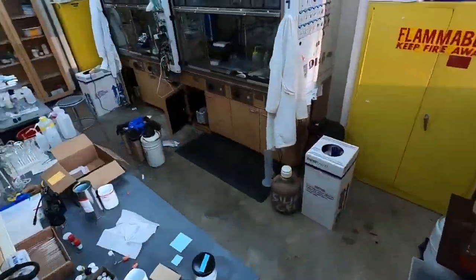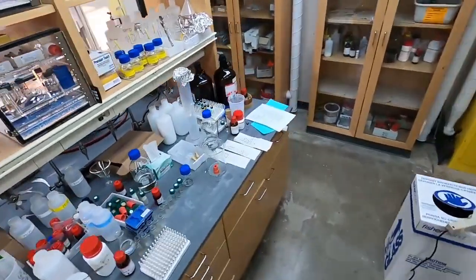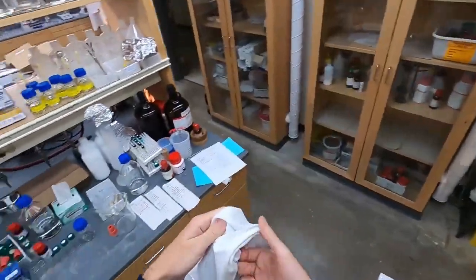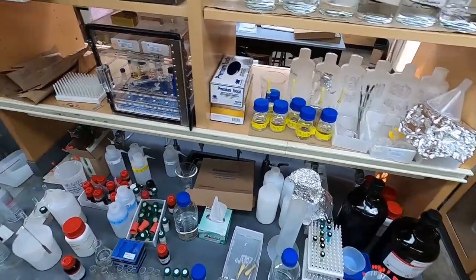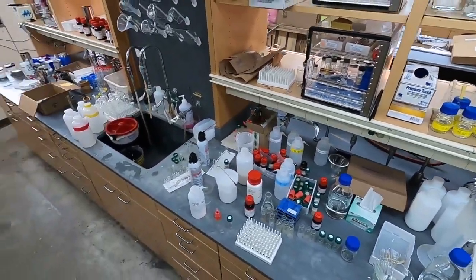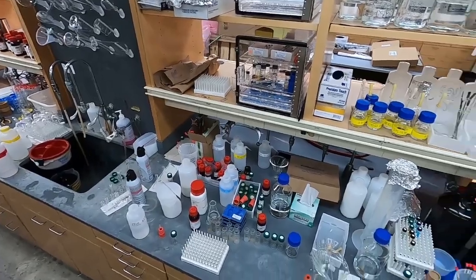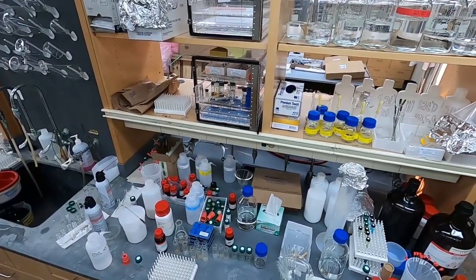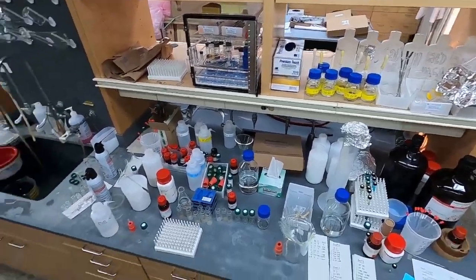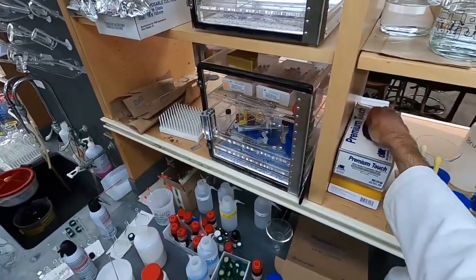And we are ready today to set up the scale-up reaction and to isolate the product. This is always a big step in a project. Once you have identified the optimized conditions, and we did our base screen and we figured out that sodium phosphate was the most effective and chemoselective base for the reaction.